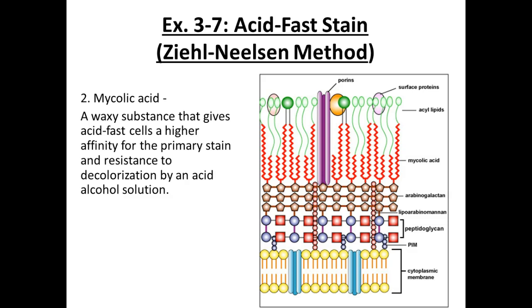Anything that falls into that wax, forget about it. You're not getting it out after it solidifies, right? So it's kind of the same thing that's going to happen here. They're going to become melty. That dye is going to get in it, right? And then when we take them off the heat and they cool off a little bit, it's going to be really hard, actually impossible. In all the years of my working with acid-fast, I've never seen an acid-fast organism decolorize. So today you do not have to worry about over-decolorizing. It won't happen. It's going to be stuck.